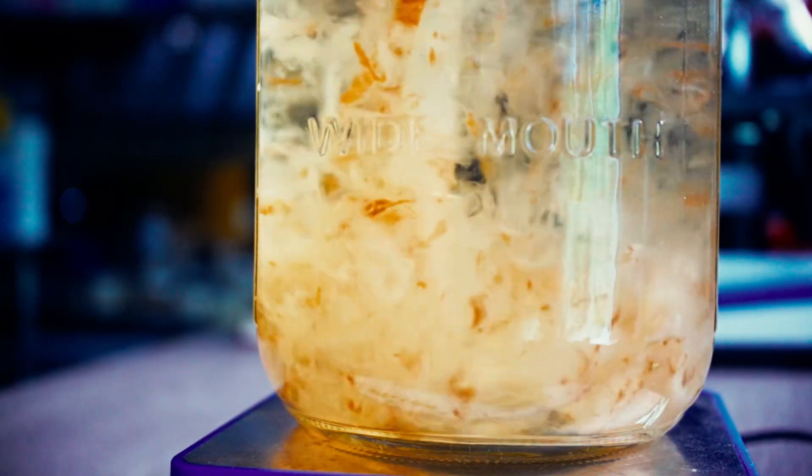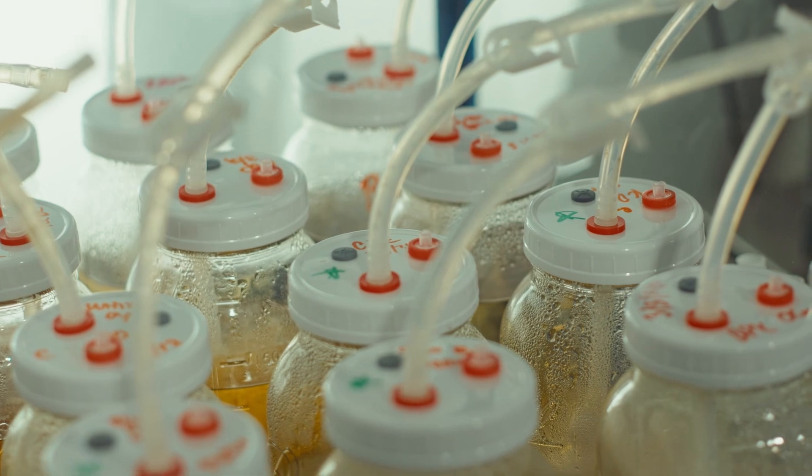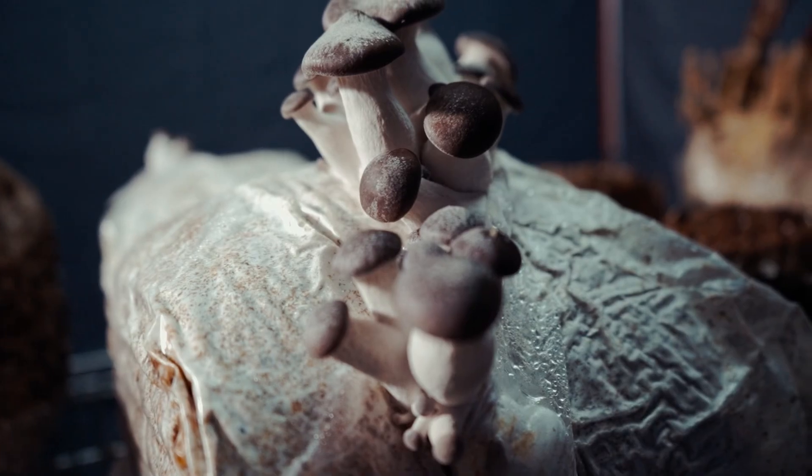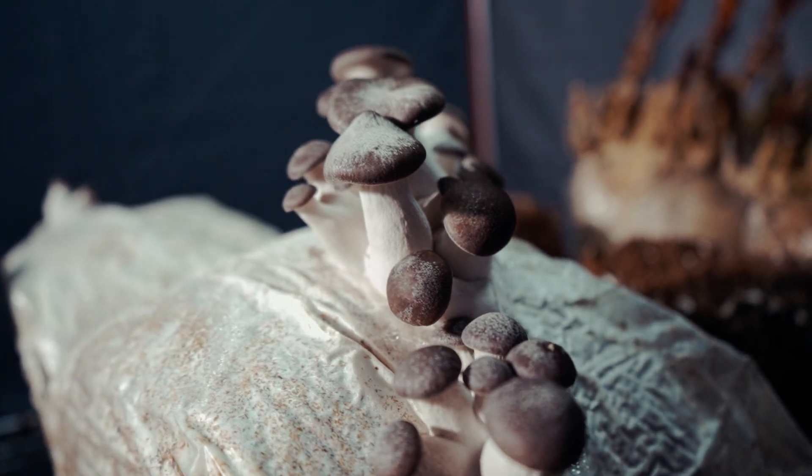Are you ready for liquid cultures? Do you need to scale fast, or are you trying to compete with wholesale prices? Liquid cultures are one of the most powerful tools in mushroom farming, but in order to successfully utilize this tool, you have to have a really good foundational skill set of aseptic technique and culture purification.